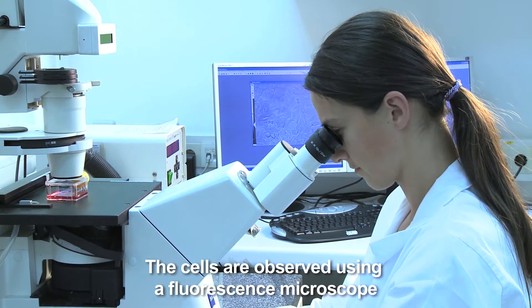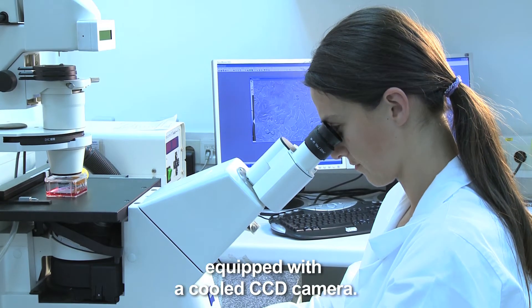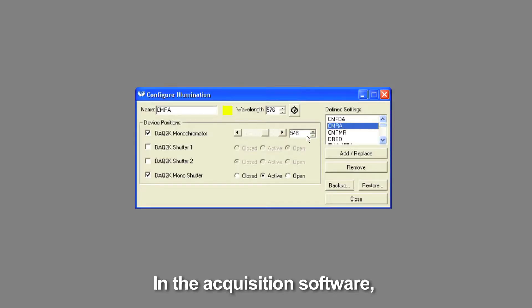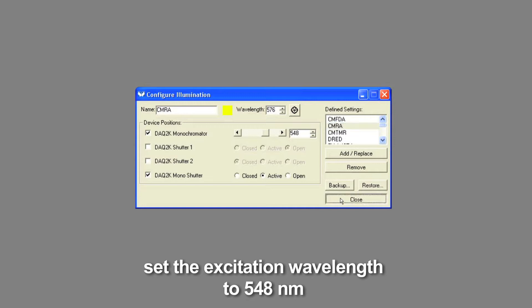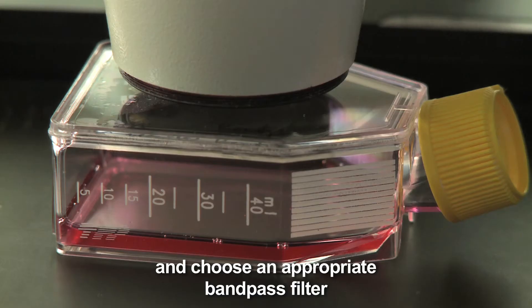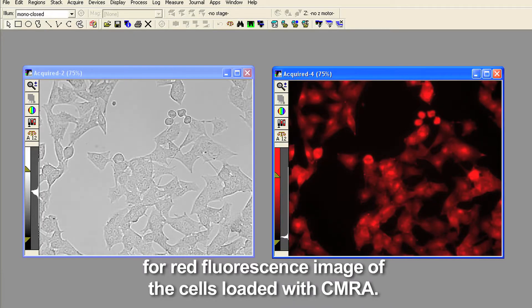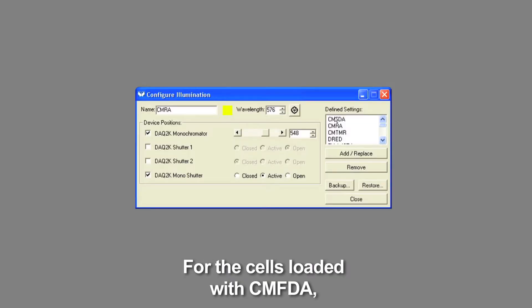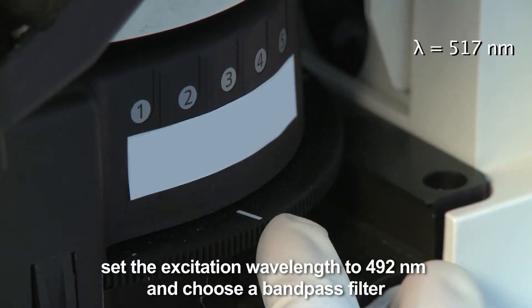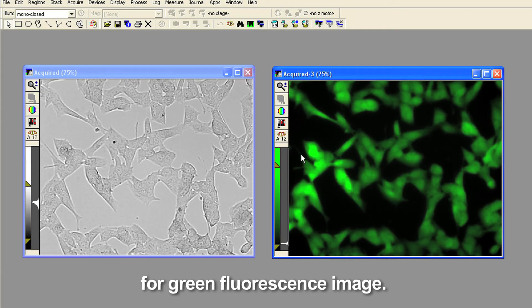The cells are observed using a fluorescence microscope equipped with a cooled CCD camera. In the acquisition software, set the excitation wavelength to 548 nanometers and choose an appropriate bandpass filter for a fluorescence image of the cells loaded with CMRA. For the cells loaded with CMFDA, set the excitation wavelength to 492 nanometers and choose a bandpass filter for green fluorescence image.